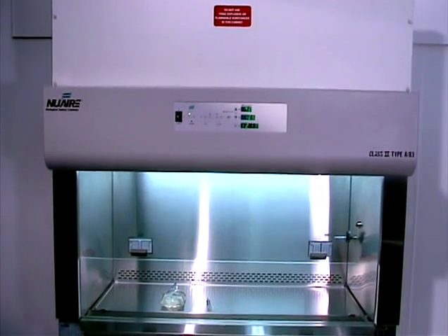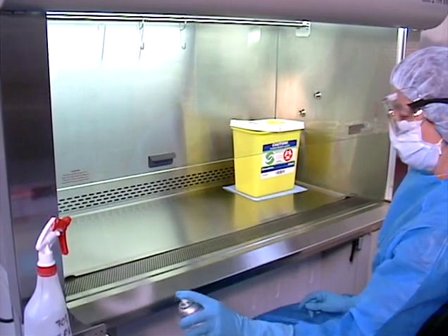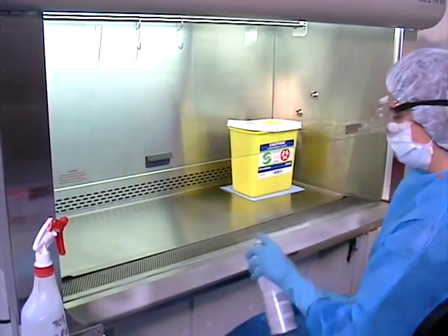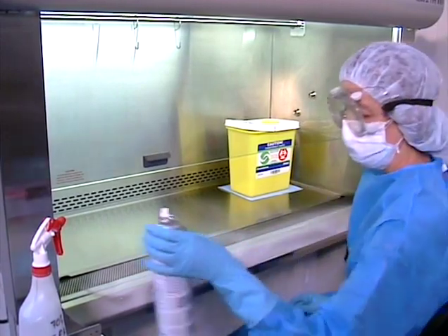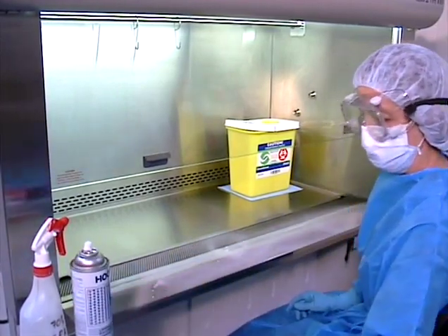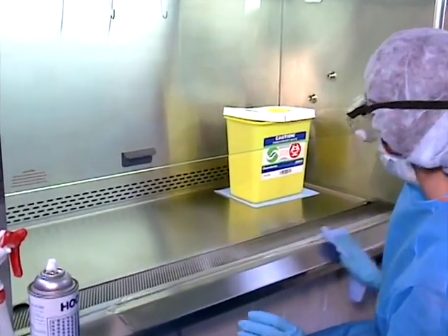Maintain the cleanliness of the clean supply hand for handling the cleaner and alcohol spray, using the dominant hand for wiping. Place the waste container on a chemo mat at one side of the work surface. Spray the outer front lip and the top of the front grill with the cleaner and wipe, starting at the bottom of the lip, working up and in.